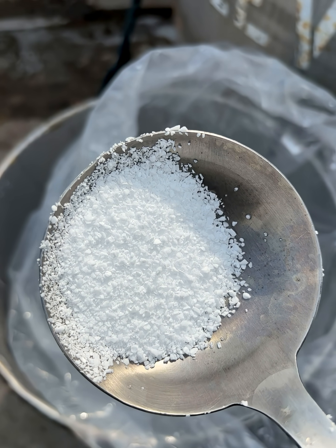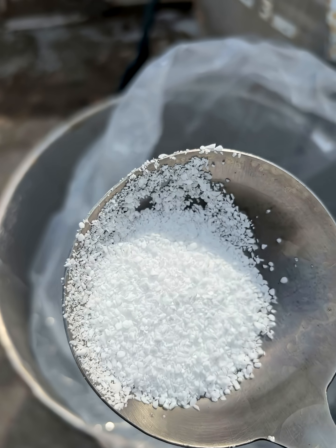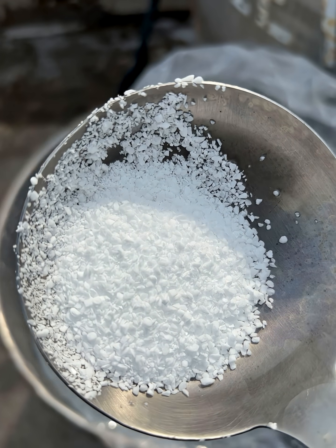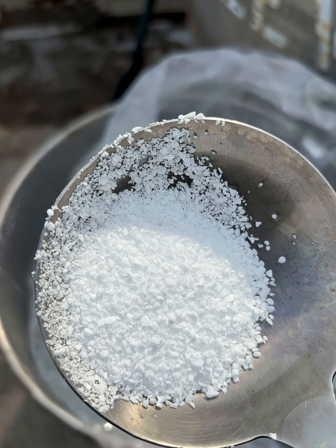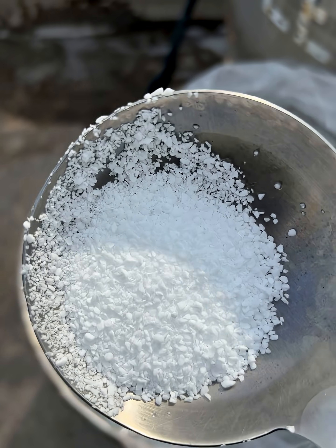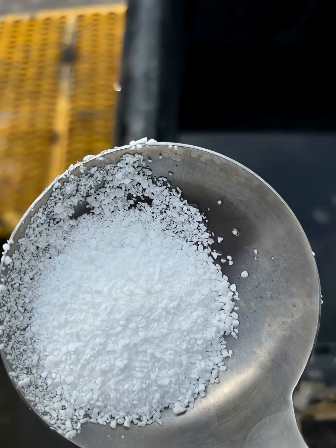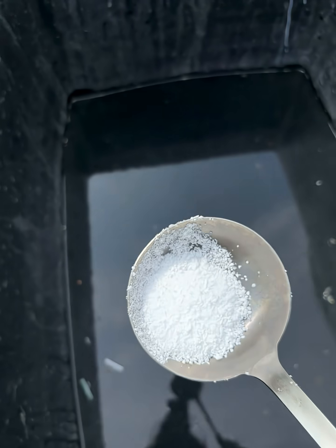This white solid is sodium borohydride. It is water reactive — it reacts with water and it's quite dangerous because it produces hydrogen gas, which is flammable. Anywhere the water reaches it, it can actually also cause fire. Let's see how it actually reacts with water.